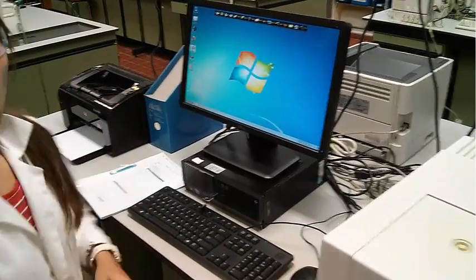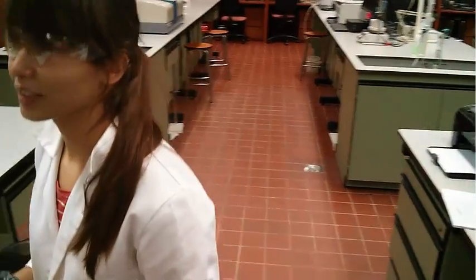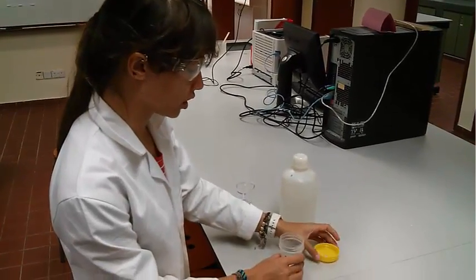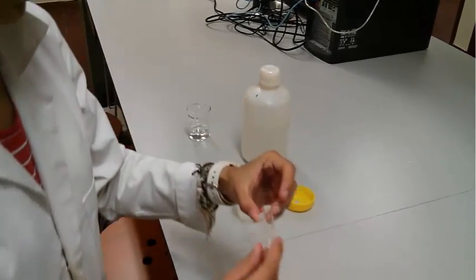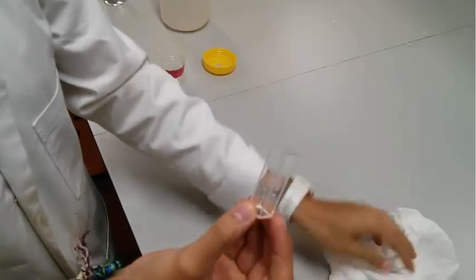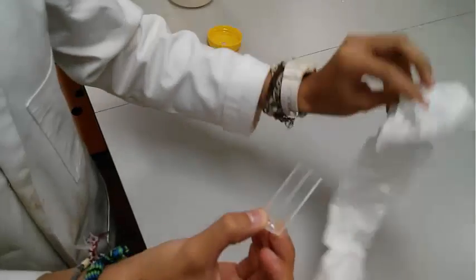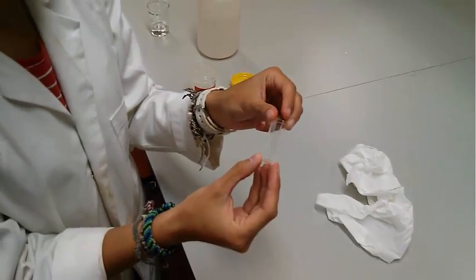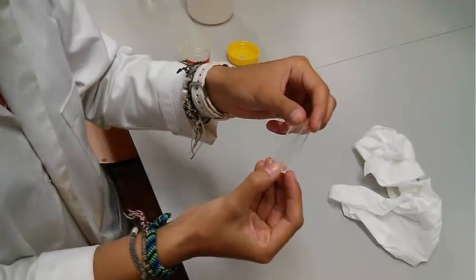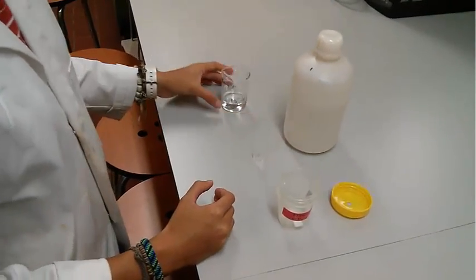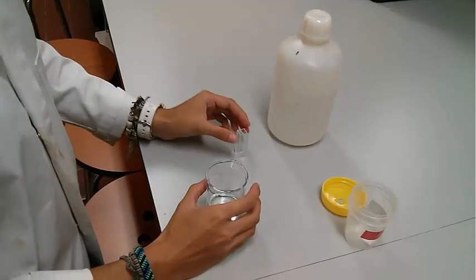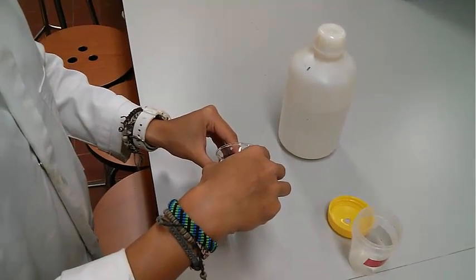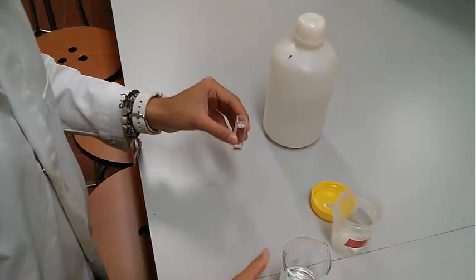The software is here. Now we'll go and put our samples in the cuvette. As Dr. Watts said, we're using a cuvette which is clear on all four sides because the light is going to come out at a 90 degree angle. It might be worth just washing the cuvette with DI water before you put your sample in, just to make sure that you've got rid of any dust or any remnants that were in there from the last sample. You've got a sample here. You guys will obviously be pouring out from your volumetric flasks. It's probably worth just washing the cuvette once with your sample, just to make sure that it's flushed out everything that was previously in there.